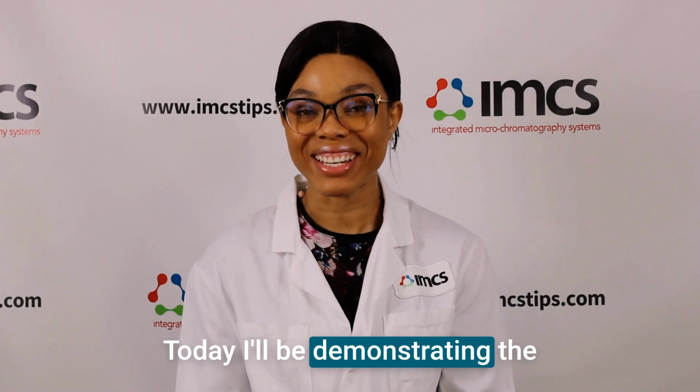Today I'll be demonstrating the capabilities of the MidiPure IMCStips for automated plasmid purification on the Dynamic Device Lynx system.